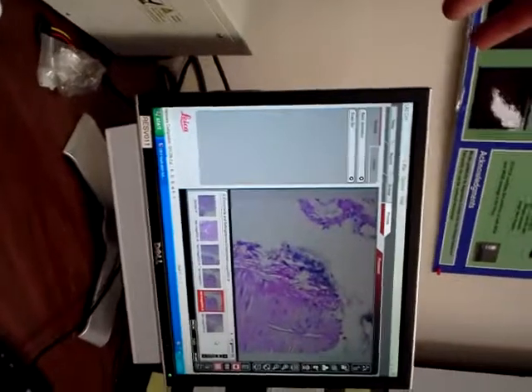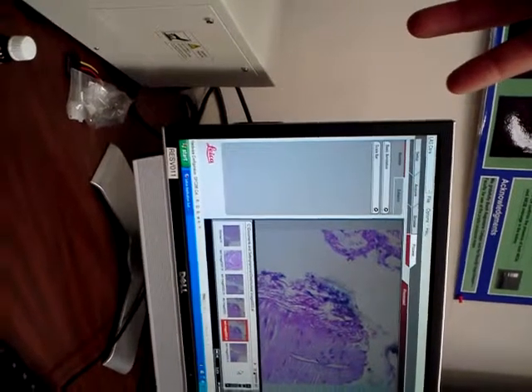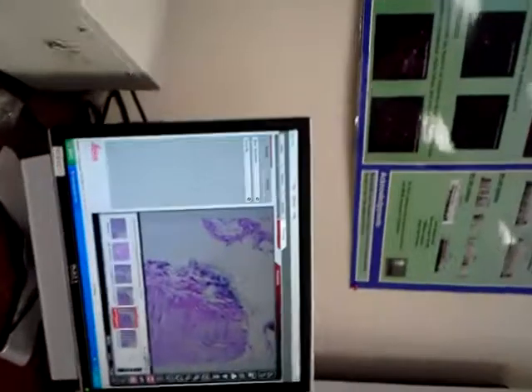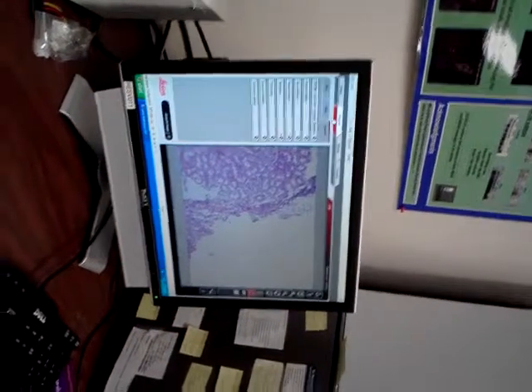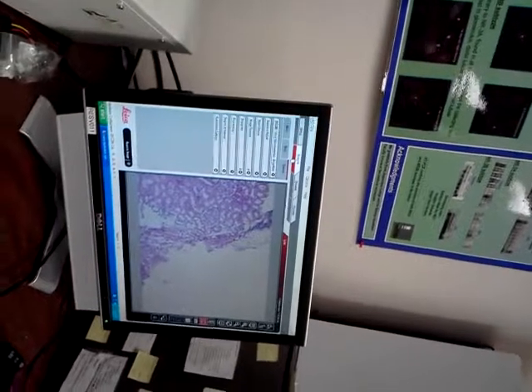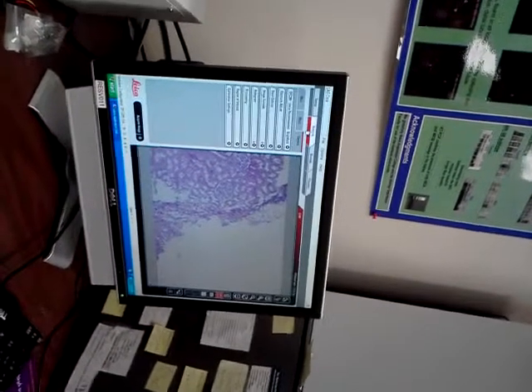Usually it's not an issue, but sometimes in the summers it's pretty crowded on the scopes. And this is the type of scope with light microscopy where I predict there'll be more extended periods. When we do things with light microscopy, it's going to be a survey sort of thing, real detailed, with a lot of acquisition.